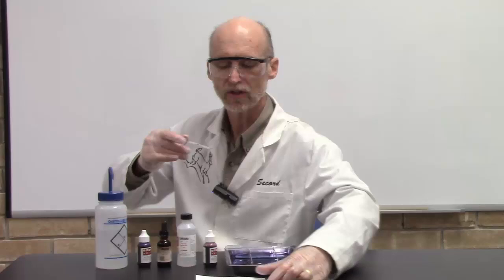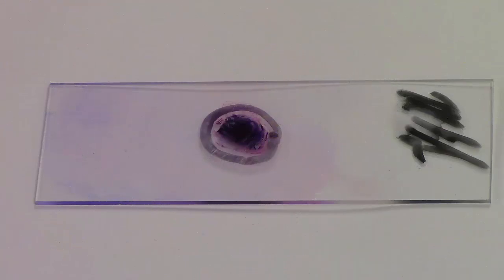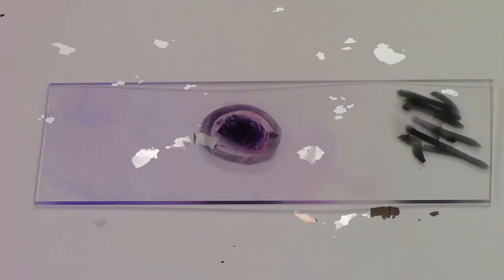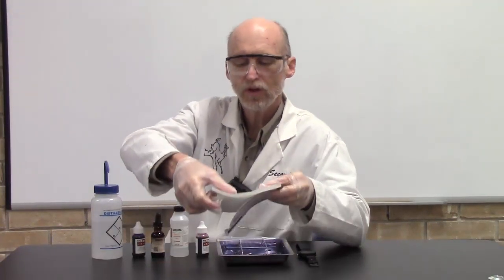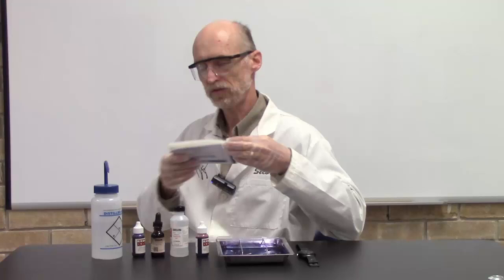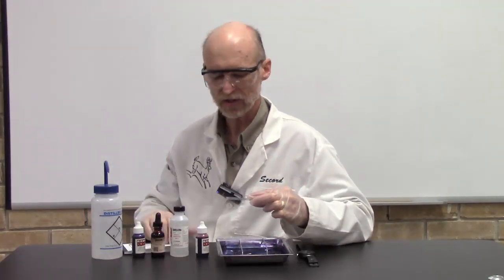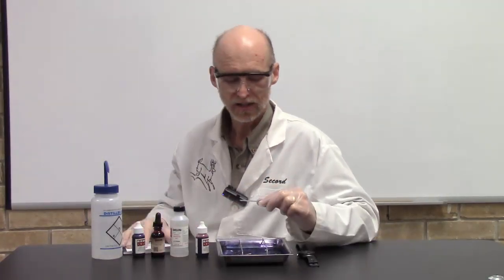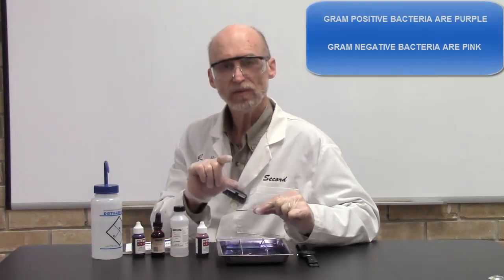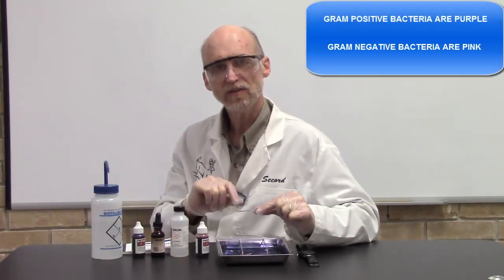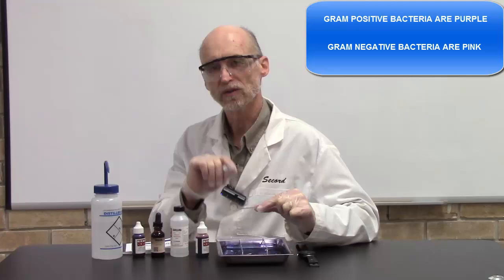Let me show you what it should look like. I'll put it out there and do a close-up for you. When you look at this under your microscope, if you performed it properly and if your bacterial smear wasn't too thick, the thick cell walled bacteria will be purple, the gram positive. The thin cell walled will be pink, the gram negative.